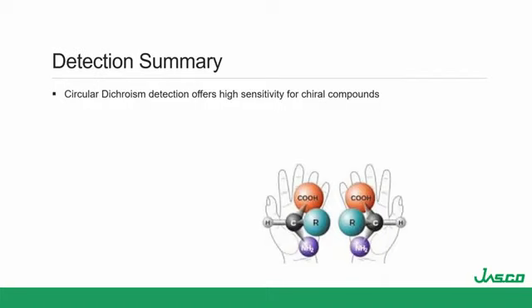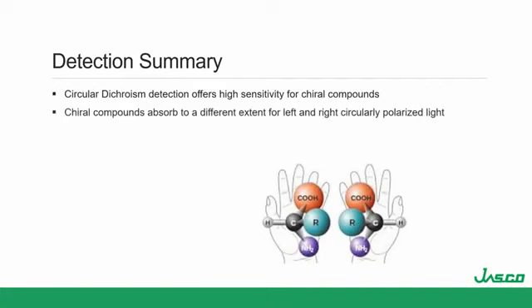So you can address the racemization one of two ways. You can let the racemization take place and then use preparative chromatography to remove the unwanted compound, or you perform a stereosynthesis to produce only one. Typically, one of these methods is more cost-effective, and which one depends on the compound, but either way you look at it, the resulting batch will need to be tested for enantiomeric excess, or EE.